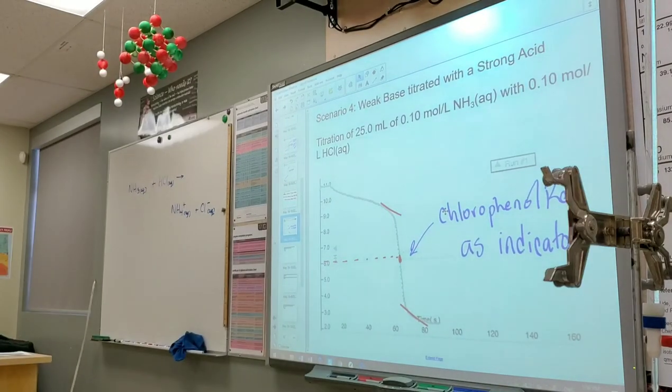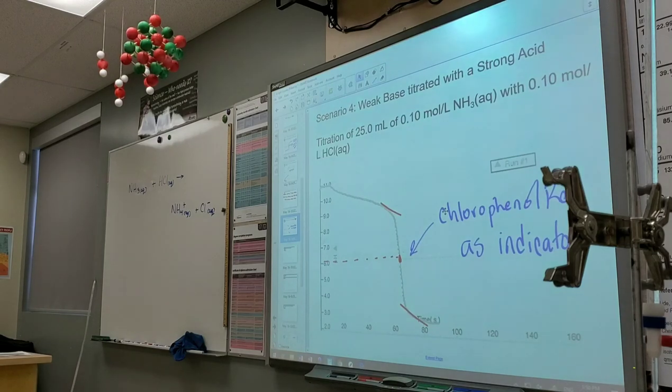It's when we've added equal acid and base, and they're no longer present because they both reacted with each other, right? There's no more acid. There's no more base. There's just only the products of our reaction and water. I'm going to give you new numbers, but you have to do all of that math. There's a checklist right here of what you have to do.